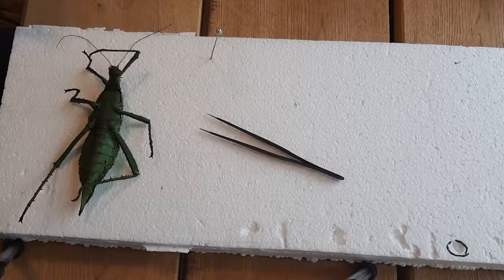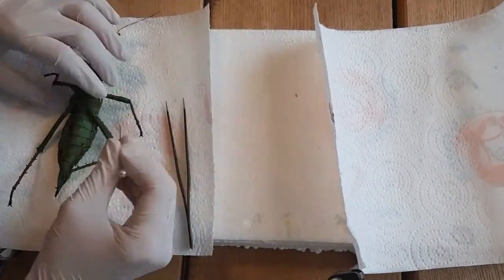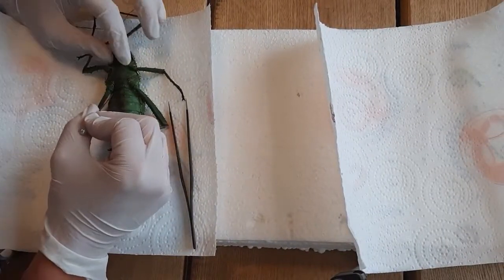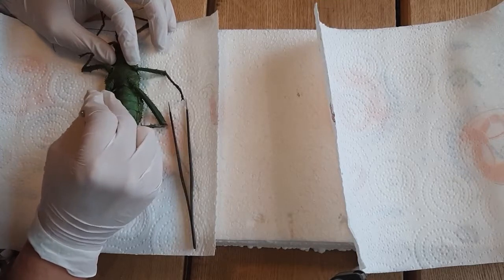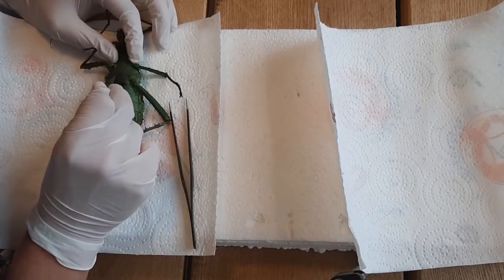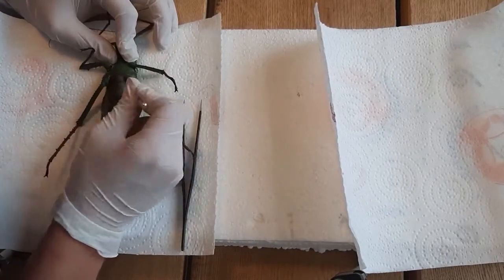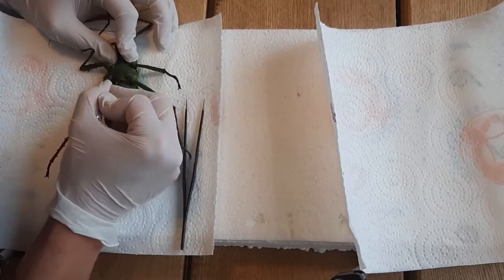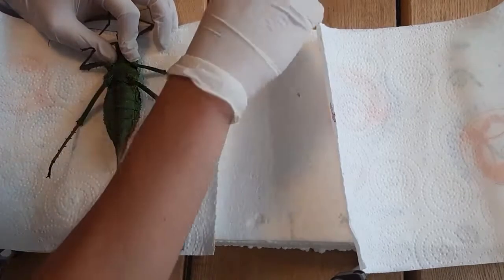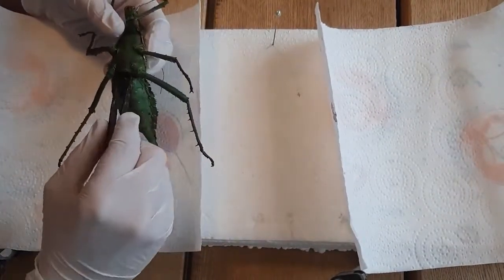Welcome to a new video on mounting insects. Here I will show you how to mount a stick insect. What you will need is a foam mounting board, which can be styrofoam, plastizoate, or any soft plastic foam that you can put needles into. Besides that, you will need long tweezers, something to cut like a razor blade, and kitchen paper or paper towels — toilet paper also works.